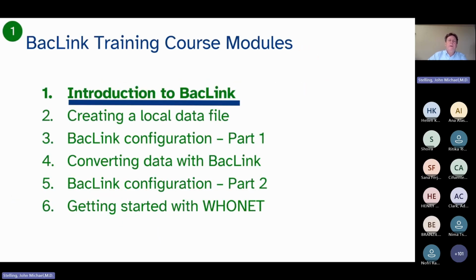Great, thank you. So the BacLink training course has 6 modules. Number 1, Introduction to BacLink, and I will cover a portion of that module today, followed by a live demo. And then I will talk about all of these other steps today, but there will be modules dedicated to them. How do you create a local data file? How do you run BacLink configuration?